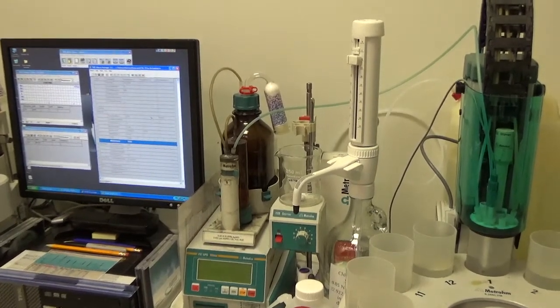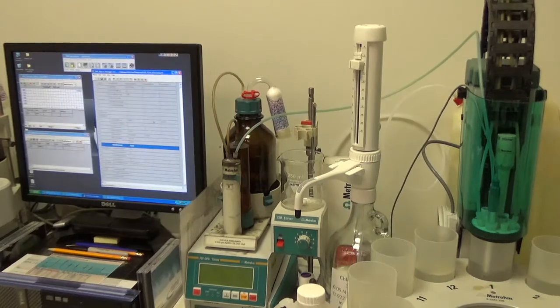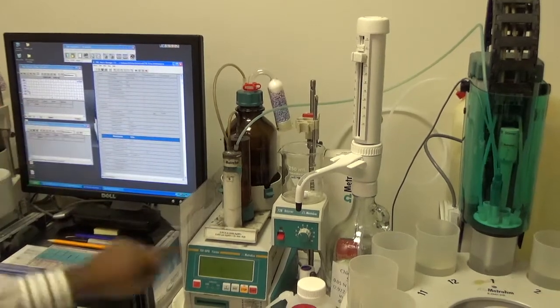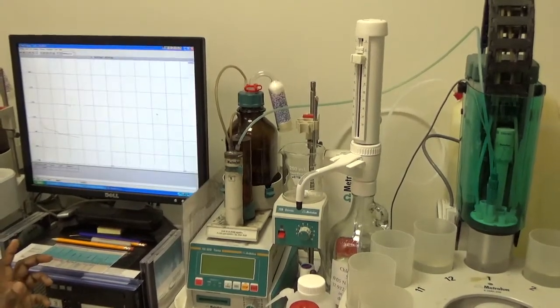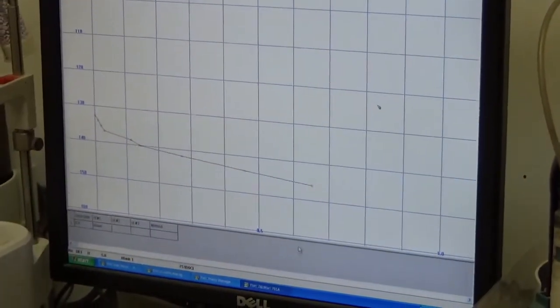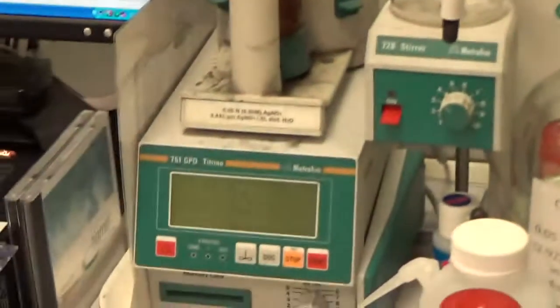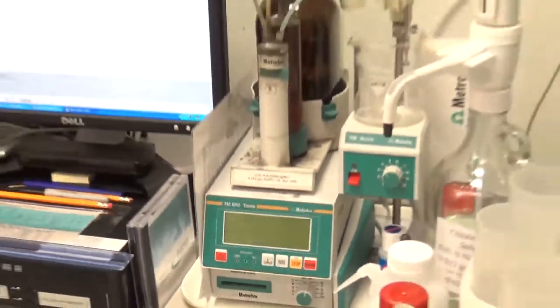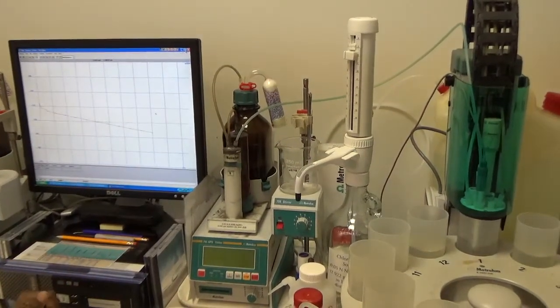To stop the titration at any time, press the red box; to start, press the green arrow. Once titration starts, the plot appears on both the computer screen and the small screen of the 751. You can expand the plot to see each increment of silver nitrate added along the x-axis and the millivolt change along the y-axis. Since we added around 5 milliliters of sodium chloride, the equivalence point will come somewhere around 5.